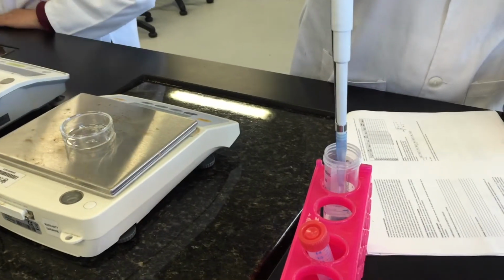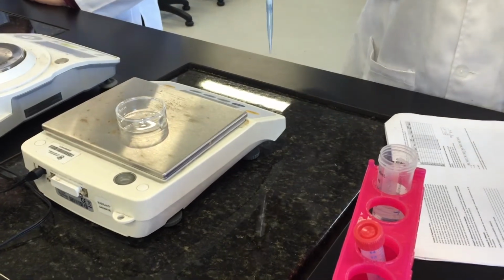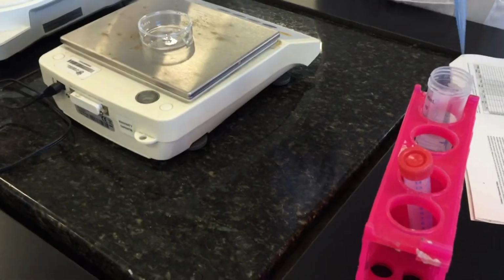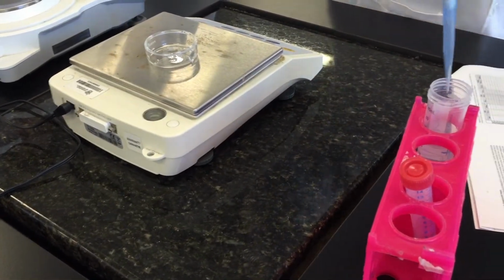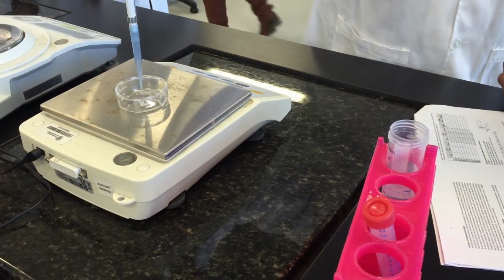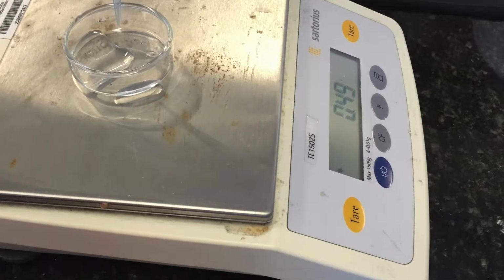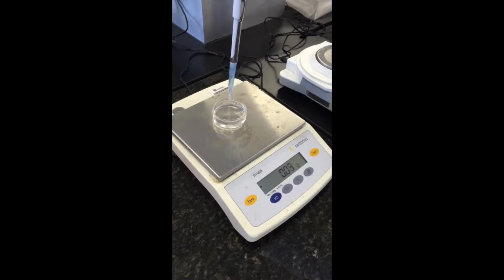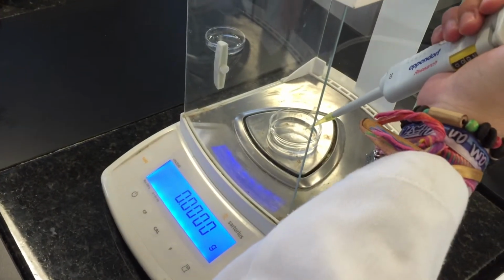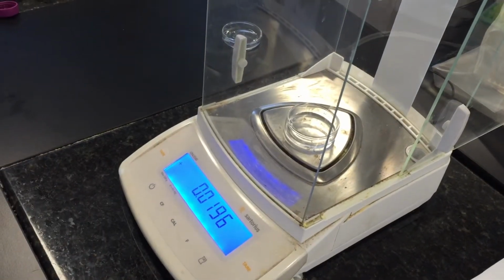To learn how to properly use micropipettes, measurements at maximum, minimum, and intermediate capacity were made. Different micropipettes available were used, which were 20, 200, and 1000 microliters. To verify that the measurements were correct, the volume was measured with the analytical balance, which was leveled before it was used. For the correct measures with the micropipette, the tip was submerged at almost half of its capacity, for the prevention of error caused by the suction of air and the remainder of the liquid.